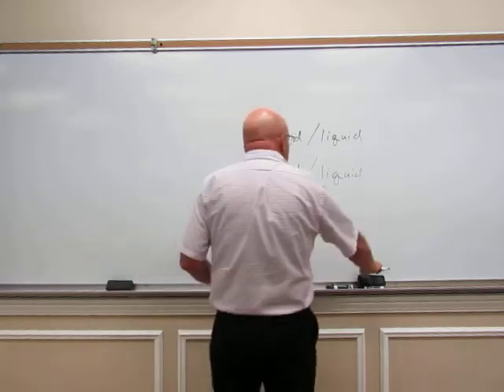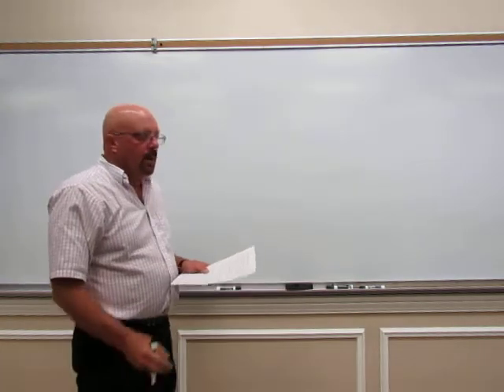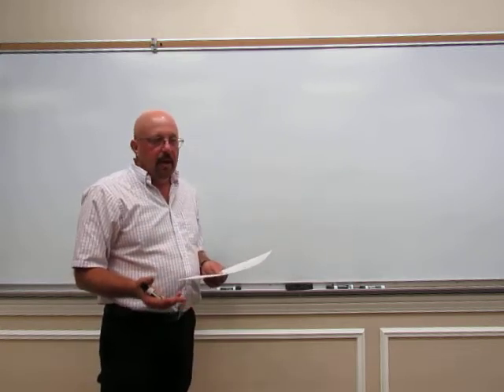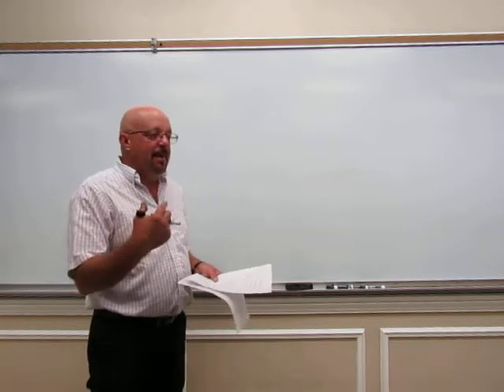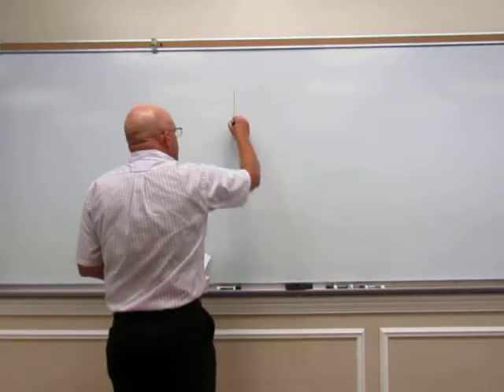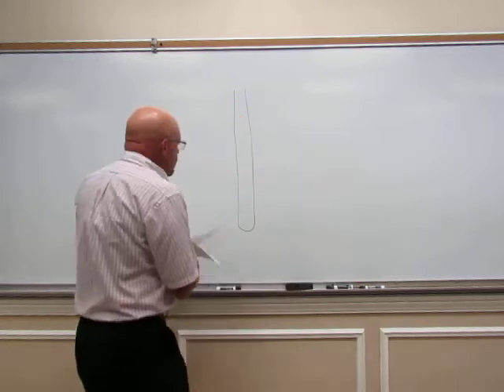Now, our liquid-liquid extraction that we're doing this week involves the distribution of a solute between two immiscible solvents. Now, it's important that our solvents are immiscible. They must be immiscible. That means they do not mix. So we're going to have two layers in our reaction tube. Now you need to know which layer is which. So let me draw a reaction tube. So we should have two layers here.